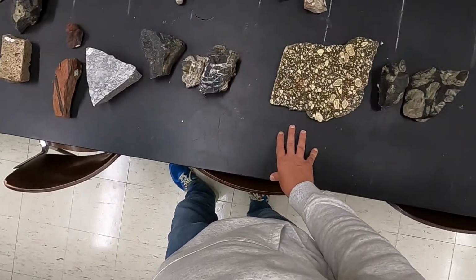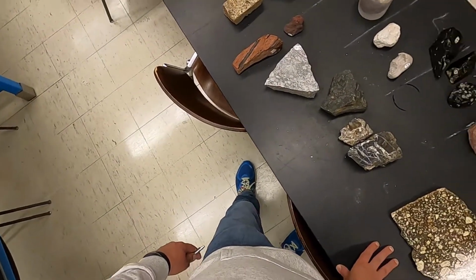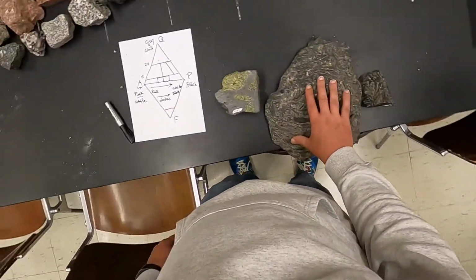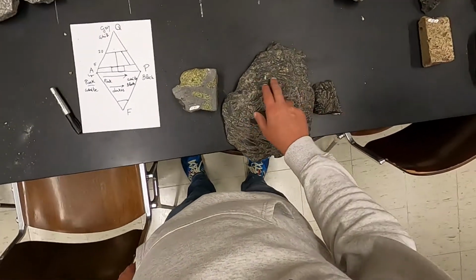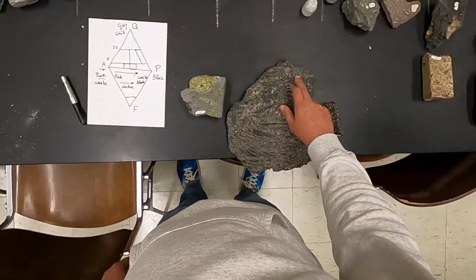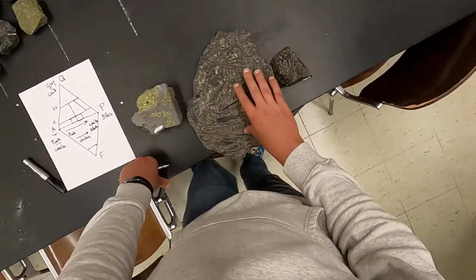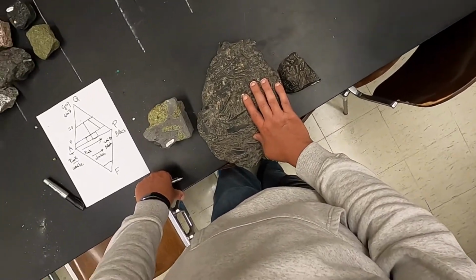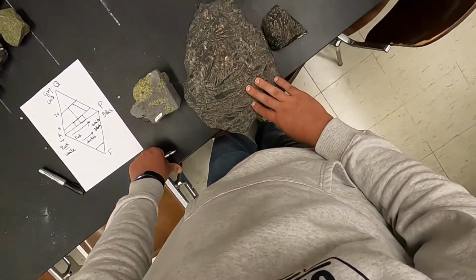Okay, so I think I have addressed most of the specimens. I am left only with the ultramafic examples, and I left them here. So again, if we consider these very characteristic elongated or bladed crystals of olivine, this is quite distinctive of very high temperature Archean basalts, which are the komatiites. So these are very unique textures.